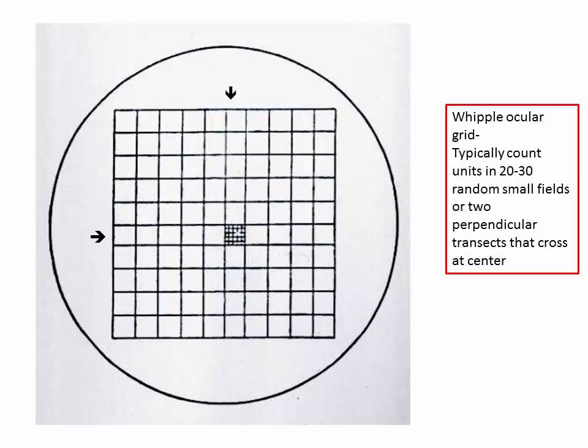And it's a thicker slide. It has wells on either side. This isn't, but I'll show you the real thing. It's raised, and there's a trough on either side of this. You place the sample here and here, so you get replicates. So you can get 2 replicates. And then these are gridded. And then you count a certain number of grids on either side of that. And let me show you what that looks like.